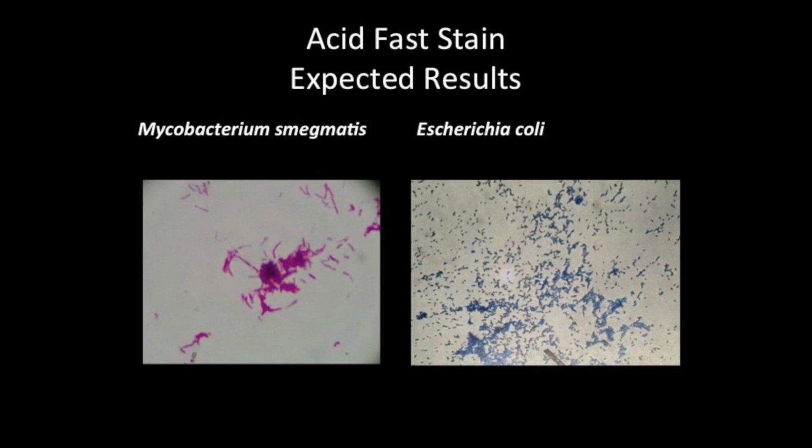Some clumping is apparent in the image seen on the screen to the left. Another important thing to note is that if you were analyzing an unknown sample, you would only be able to determine that the sample was an acid-fast rod. Additional tools would be needed to determine the species of the sample. In our lab procedure, you are given a pure culture of Mycobacterium smegmatis, and that is why you were able to identify the species name.